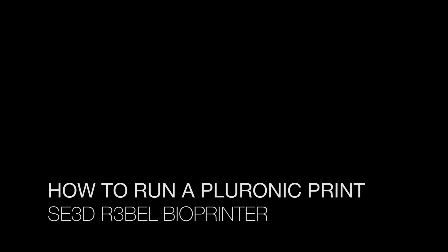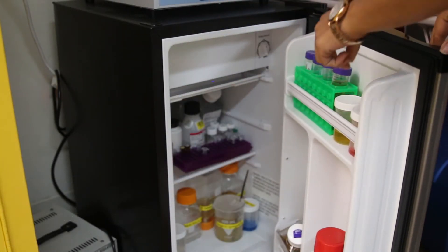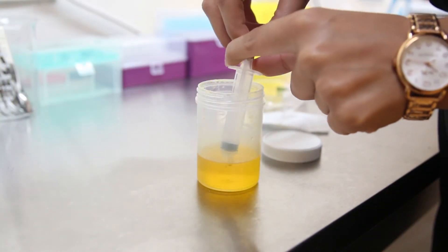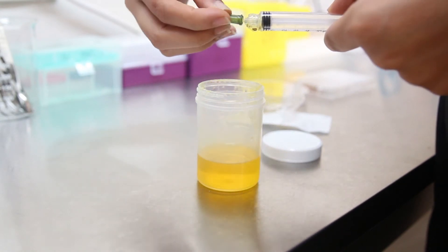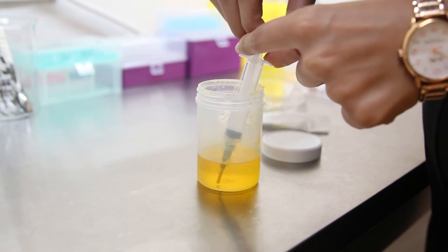You can store your Pluronic in the fridge at 4 degrees Celsius. When you are ready to load a syringe with Pluronic, take it out of the fridge and immediately fill the syringe before it gels. You can do this with or without a 14 gauge needle tip on your syringe.